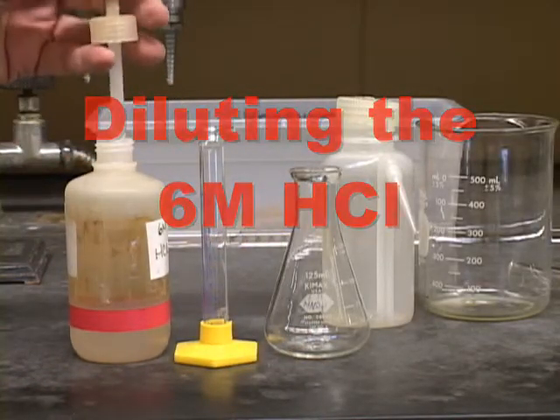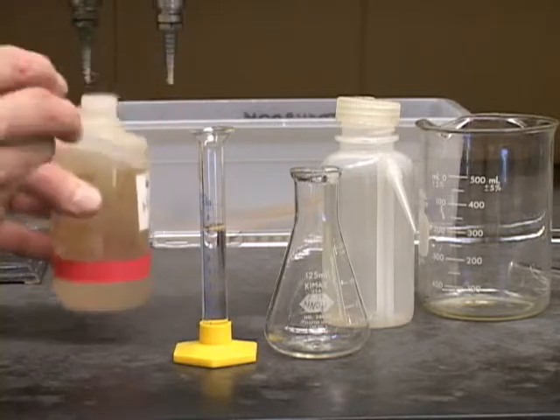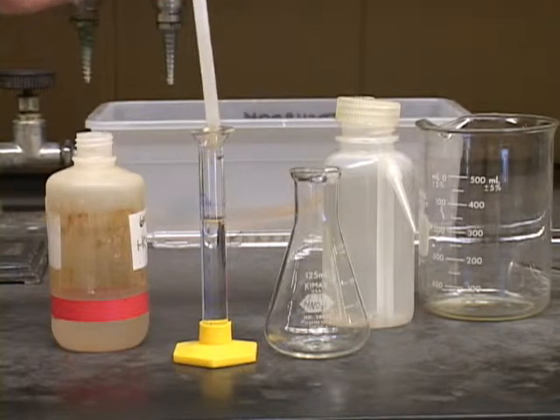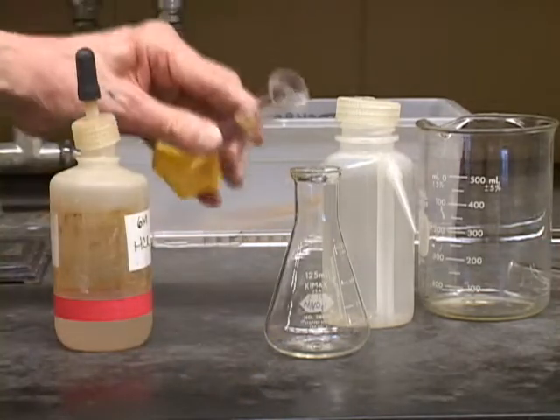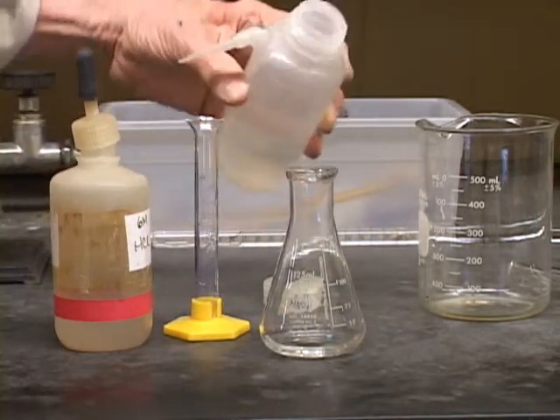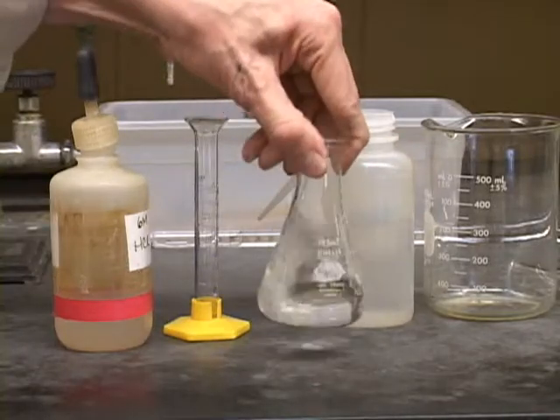You will dilute some 6 molar HCl to 1 molar HCl, but for this demonstration, we will arbitrarily just dilute 9 milliliters of the 6 molar HCl to 100 milliliters. Now you can figure out for yourself how to make 1 molar solutions. Measure out the 6 molar HCl carefully in the graduated cylinder, add it to the flask, dilute to 100 milliliters with distilled water, and finally mix thoroughly. It must be mixed thoroughly.